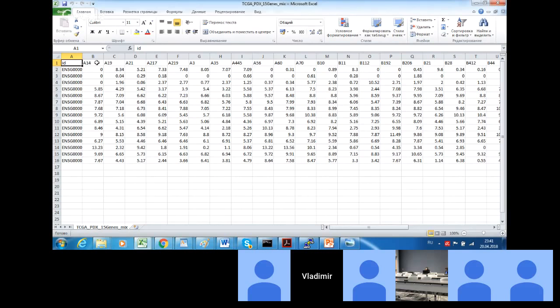So how can we go further and how can we find this division? Let me give you just a few minutes for this task. Obviously, we do not have a lot of tools here, but I hope that you'll find even the small set of tools we discussed today sufficient for this hands-on task.